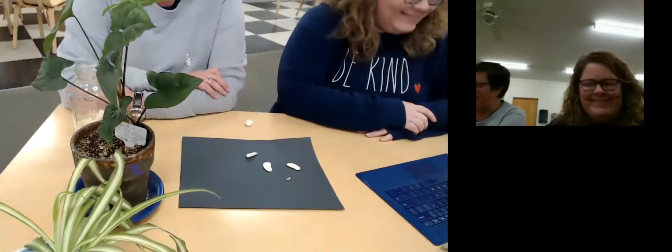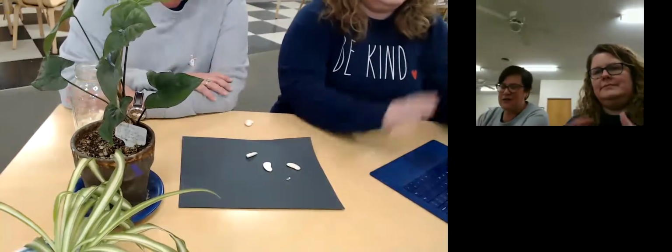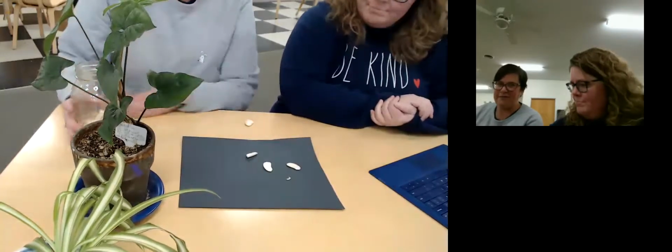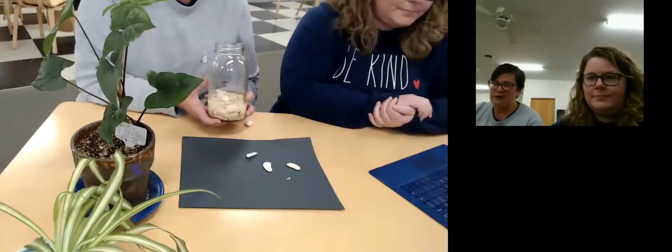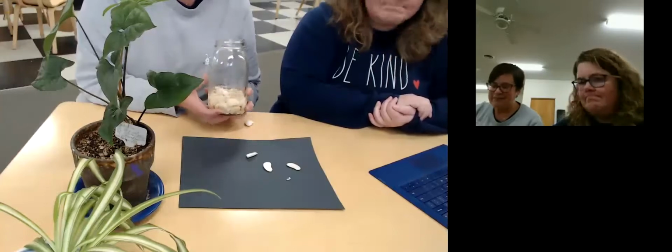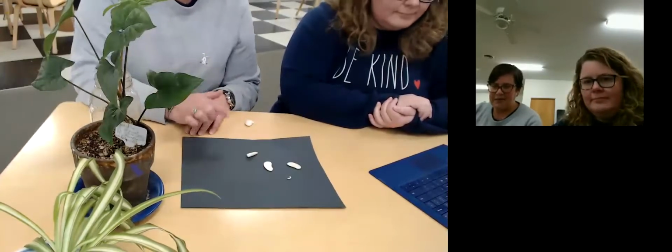And we wanted to talk to you about seed dissection and some classification of plants that you can do based on the seed. So what I have here is an exquisitely prepared jar of soaking lima beans. If you have these around your house, you could soak a few of them, let them soak for about 24 hours, and they'll be ready to dissect. And I've taken the liberty of taking one apart already, and we're going to go through the parts of the seed in a minute.